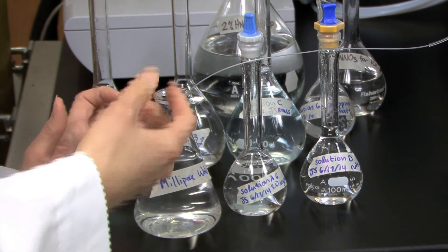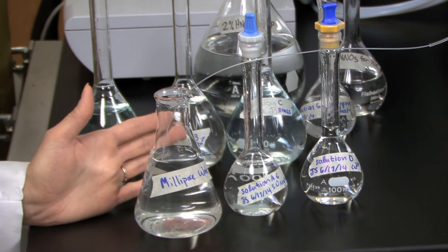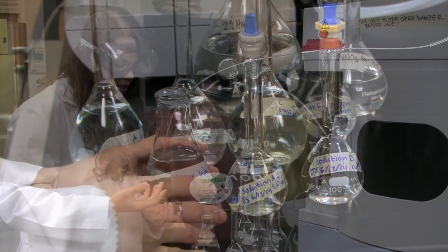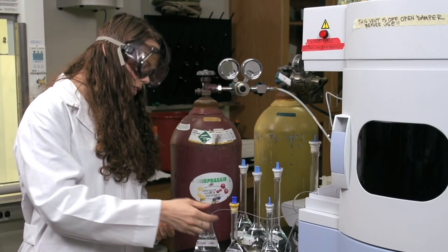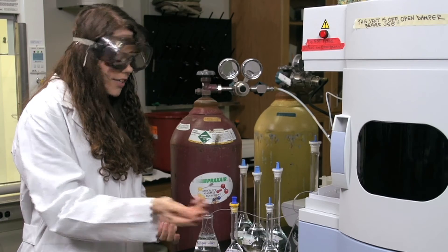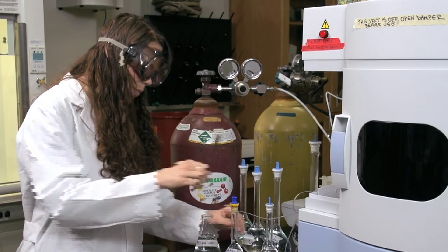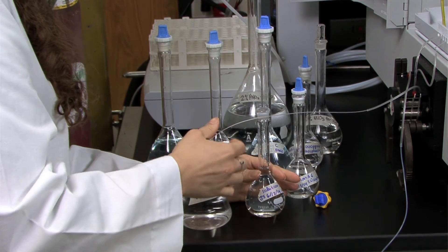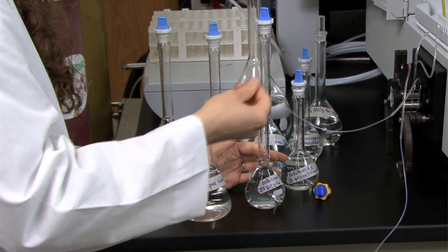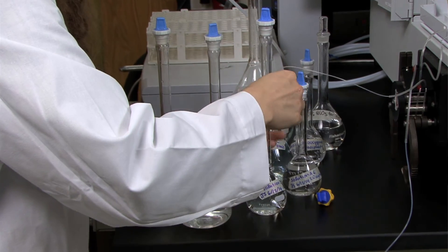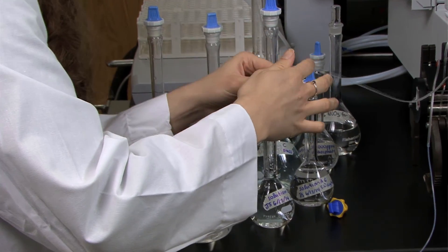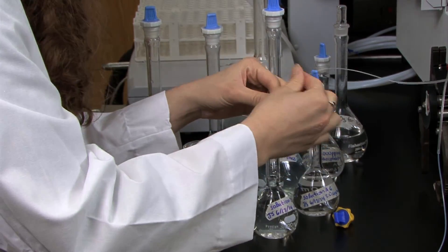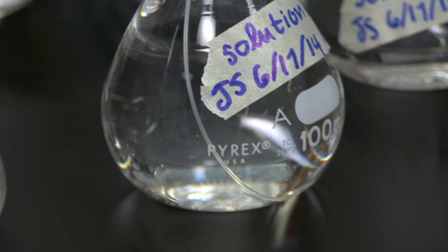If you have any problems or difficulties during the experiment, please ask your TA for assistance. To transfer the inlet line to the next solution, simply uncap the volumetric flask and move the line directly in, making sure the plastic tip at the end is fully submerged.